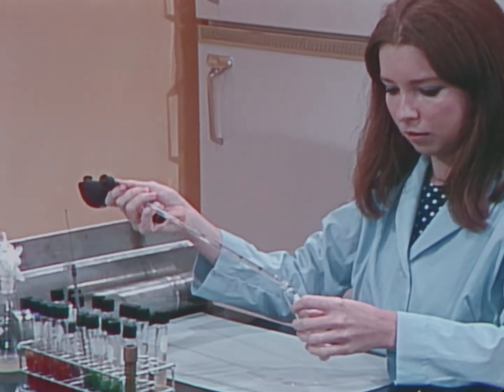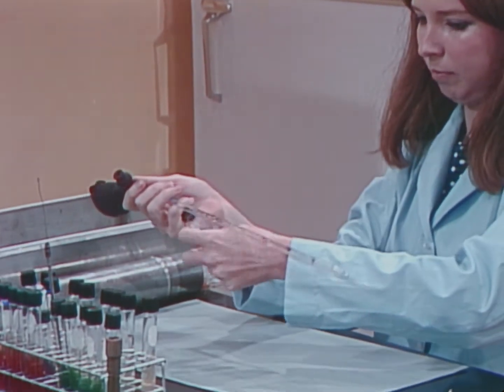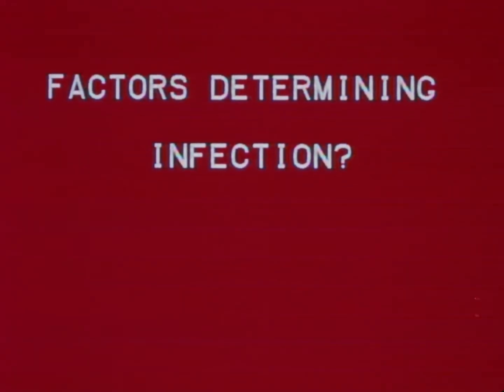Studies conducted since 1950 suggest that the following questions must be considered. What forms do potentially infectious aerosols take? What factors determine whether a laboratory worker becomes infected? What determines the relationship between these factors?